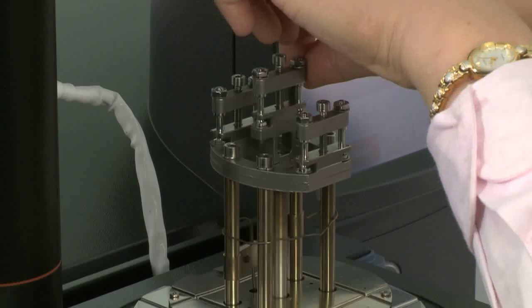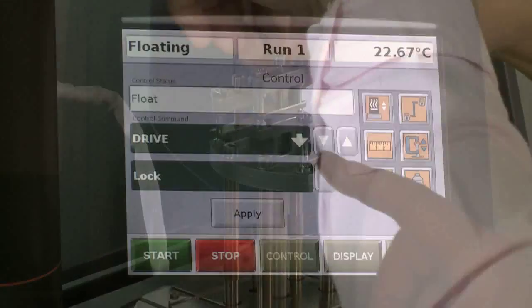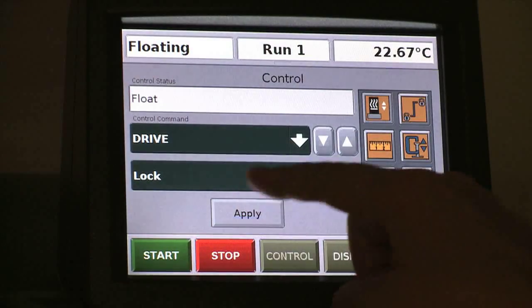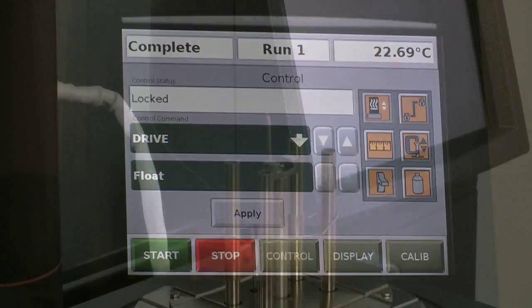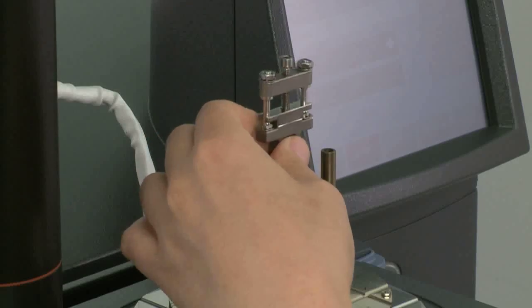Before calibration, we shall first install the clamp to the instrument. From the touch screen, lock the drive shaft. Install the movable clamp to the drive shaft.